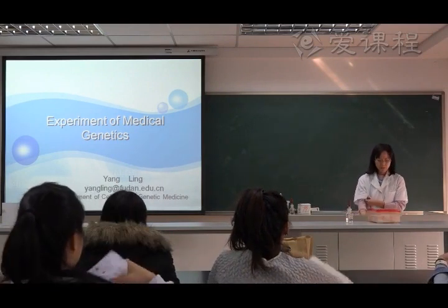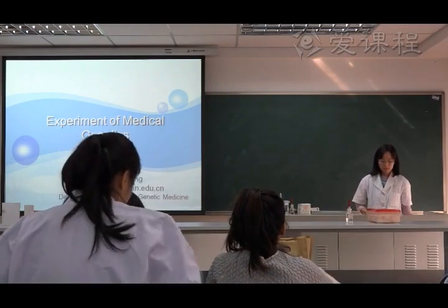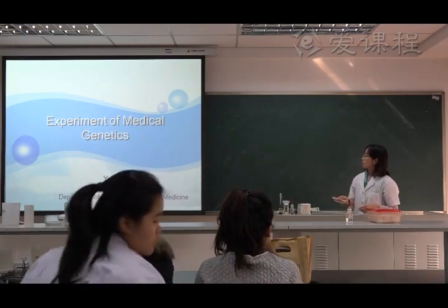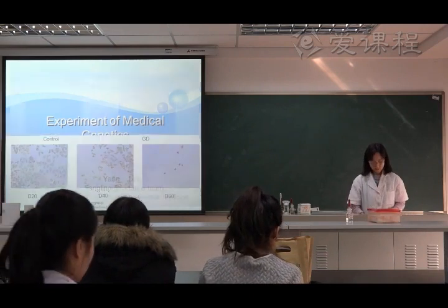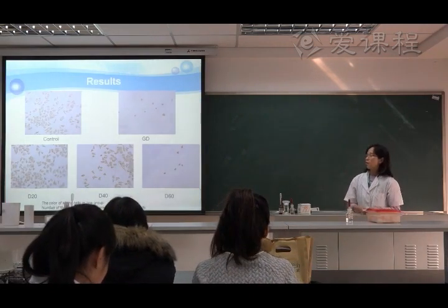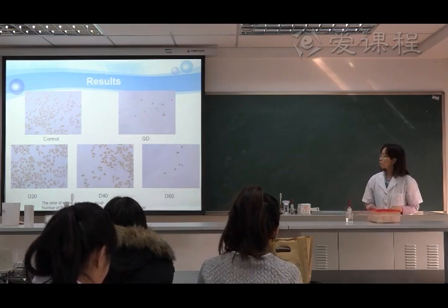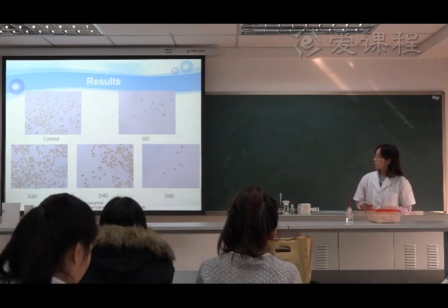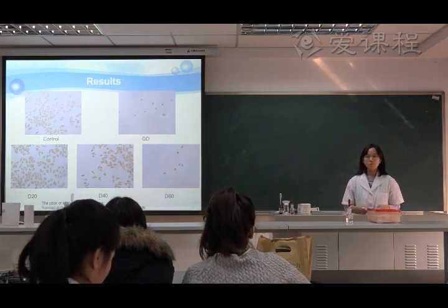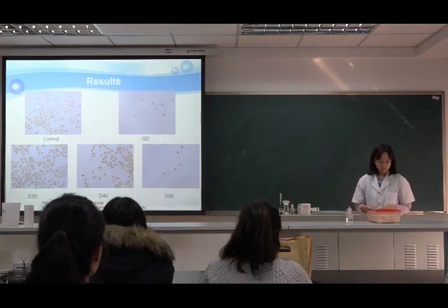It's time to begin our today's experiment. And first, I will conclude the result of the cytobiology of the last time. And this result is just from one group of your experiment.